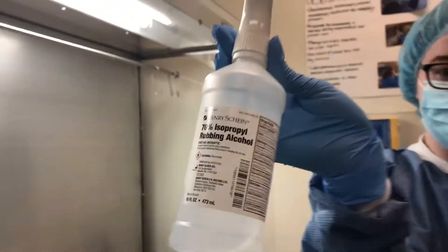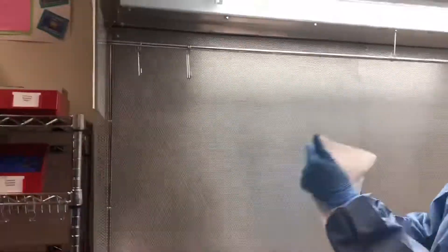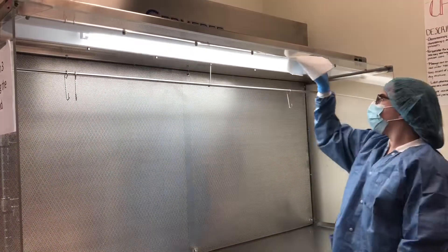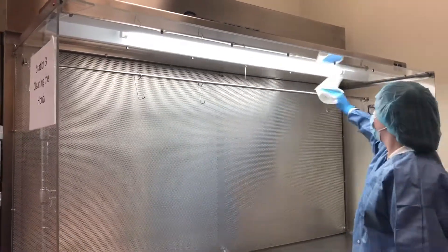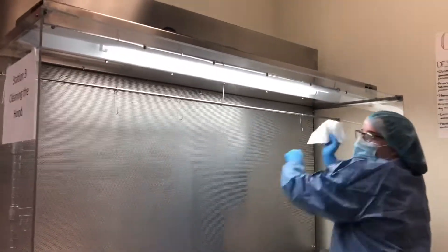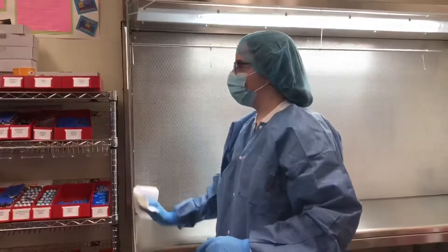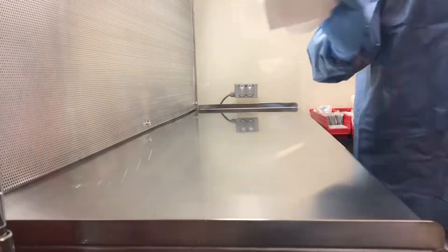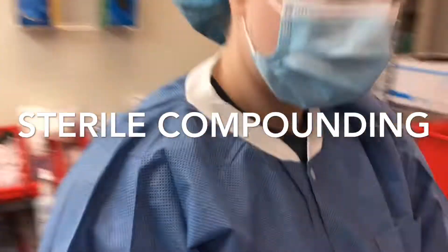Repeat the entire process with 70% sterile alcohol as stated by USP 797. The first part of creating compounds aseptically is to read the patient label.